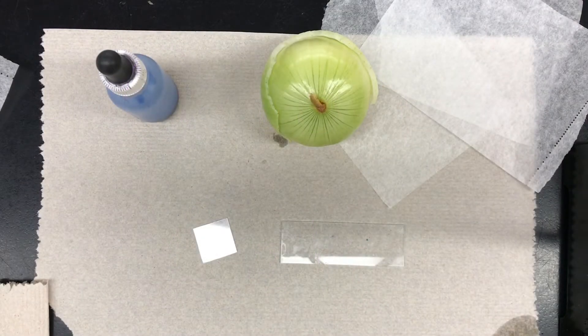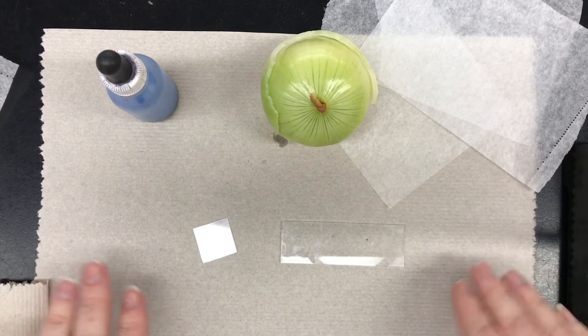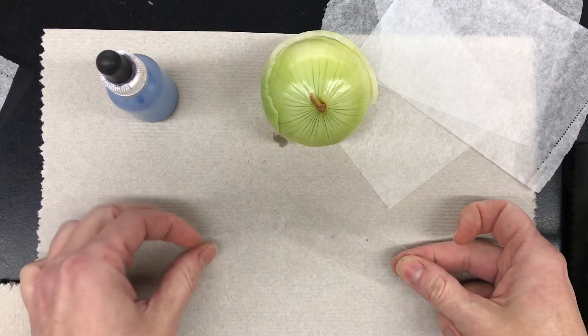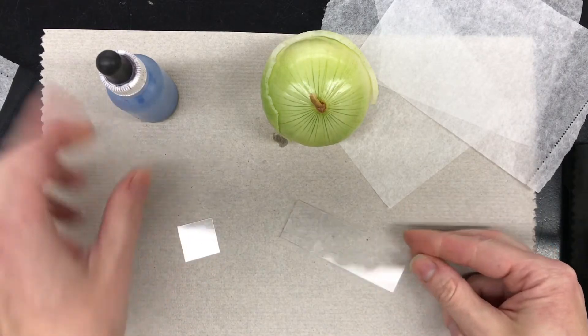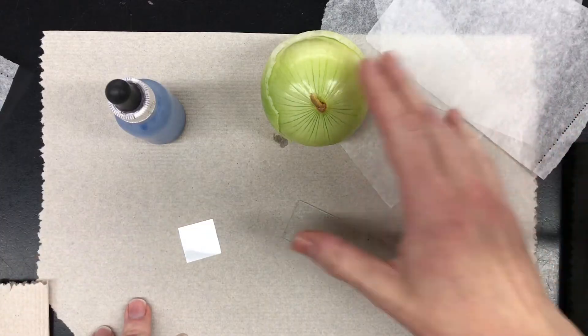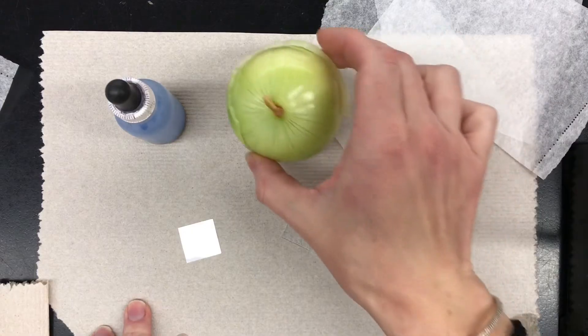To make a wet mount slide of onion cells, you're going to need a slide, a cover slip, methylene blue, your lens wipes, and an onion.